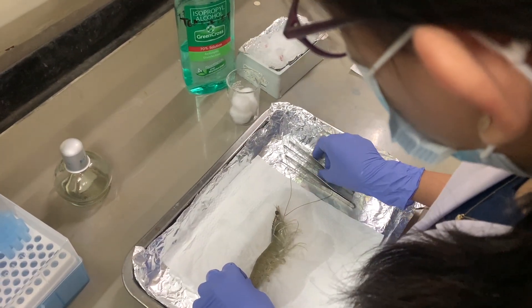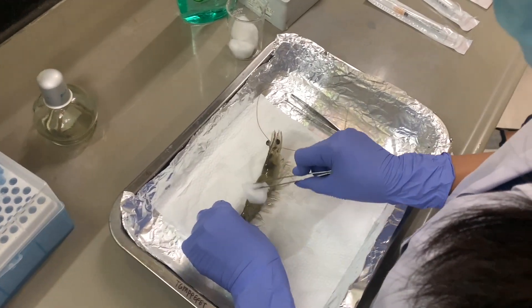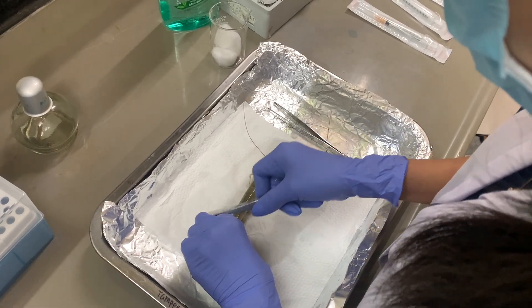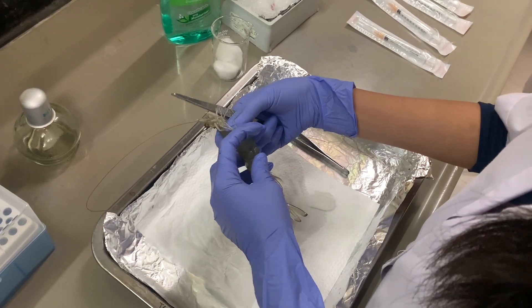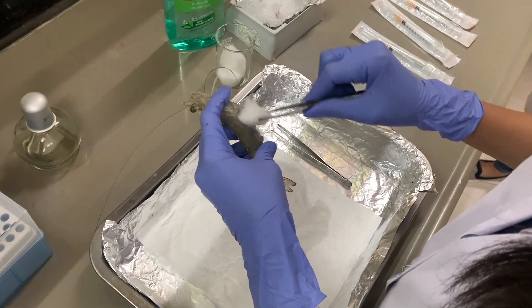Prior to hemolymph extraction, it is important to disinfect the outer surface of the shrimp. This is to prevent contamination of the samples and to protect the animal from accidental contamination with bacteria and other pathogens that colonize their exoskeleton. Disinfect the exoskeleton with 70% ethanol placed on a sterile cotton.